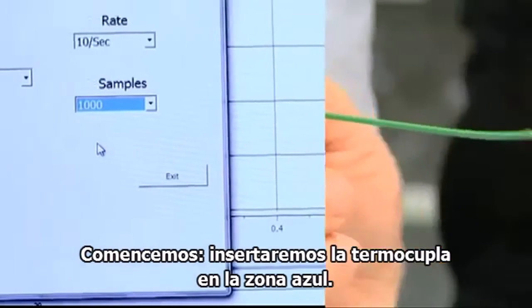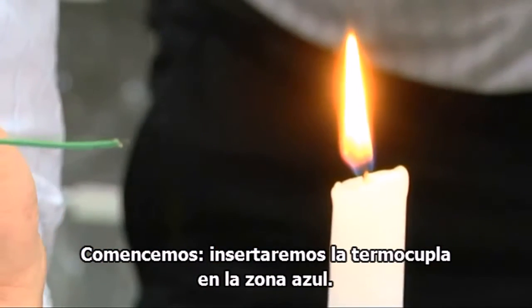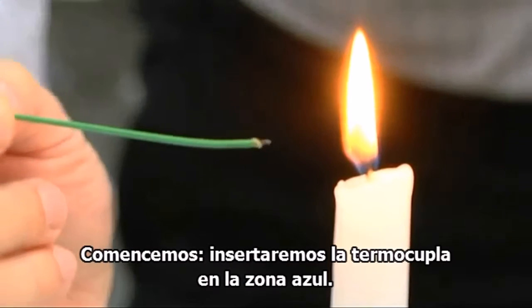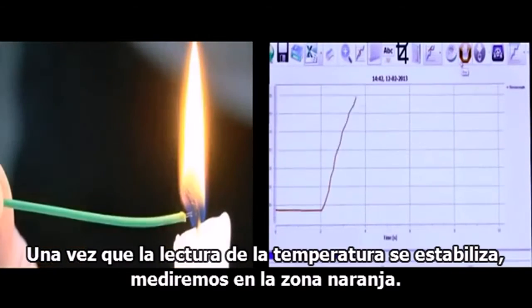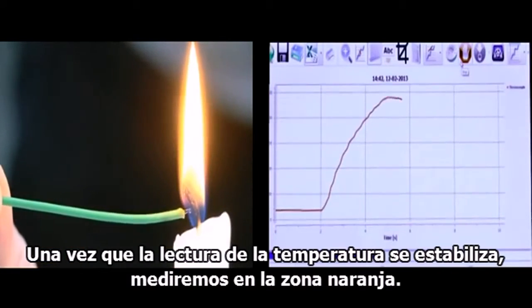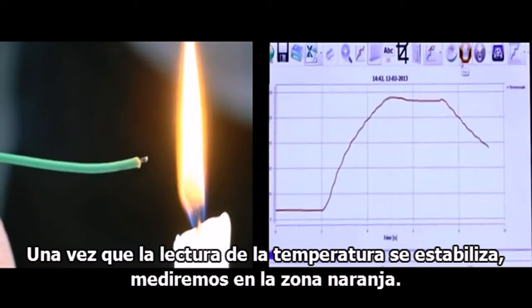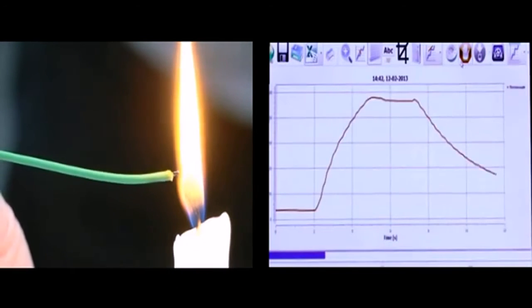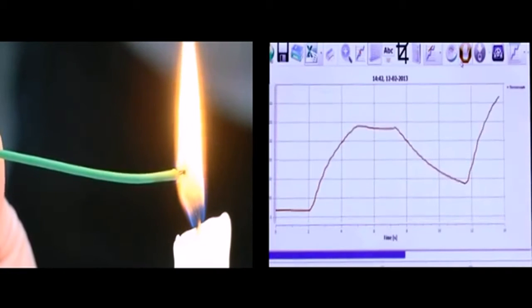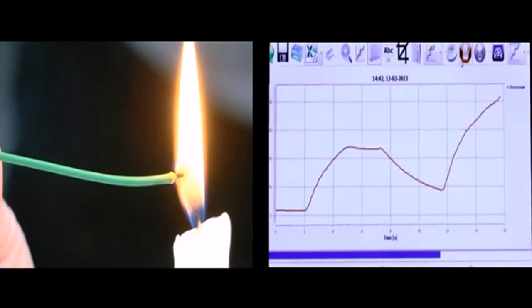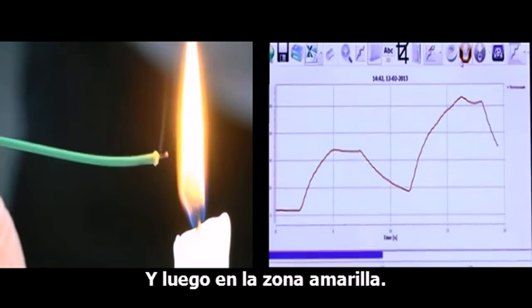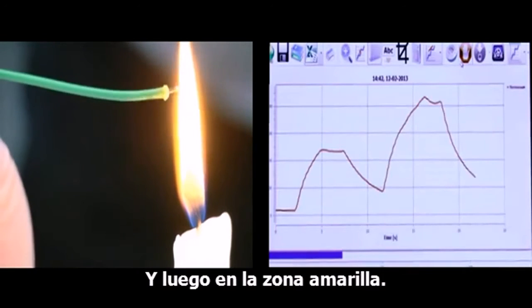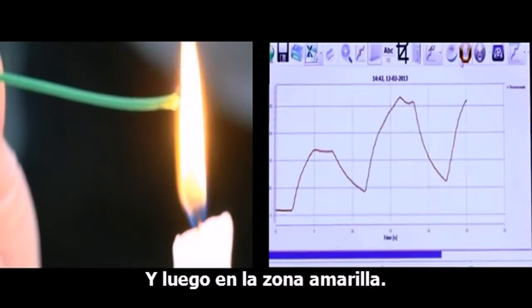Now we are ready to go. Let's begin. We will insert the thermocouple temperature sensor into the blue zone. After the temperature reading is stabilized, we will move to the orange zone, and then to the yellow section.